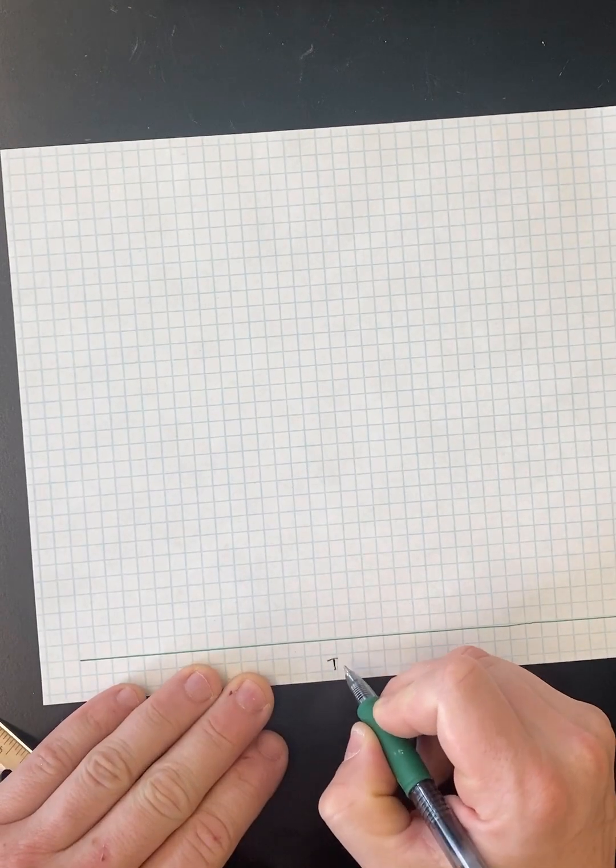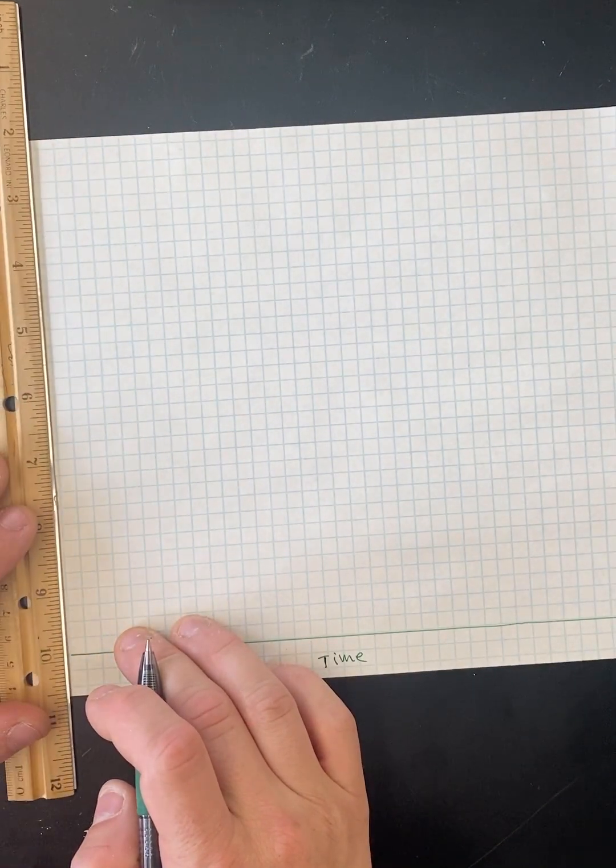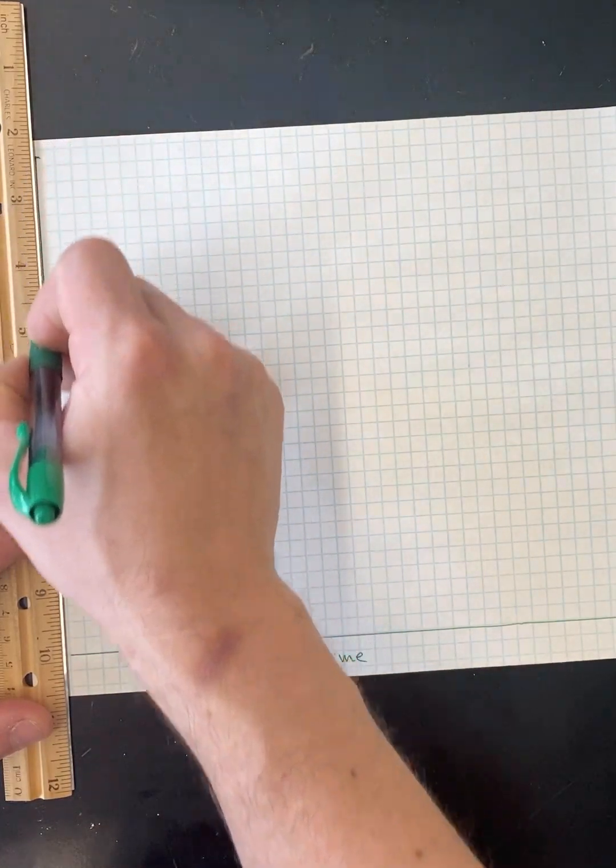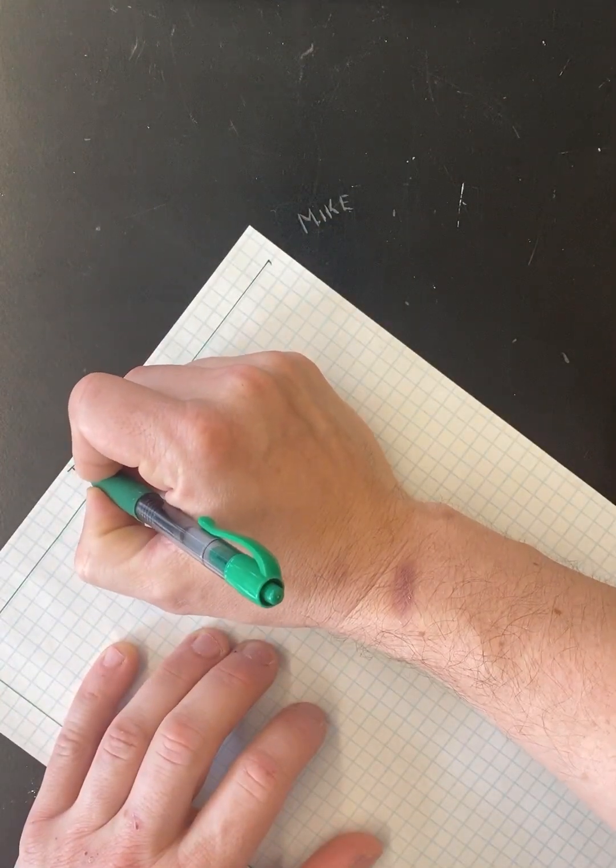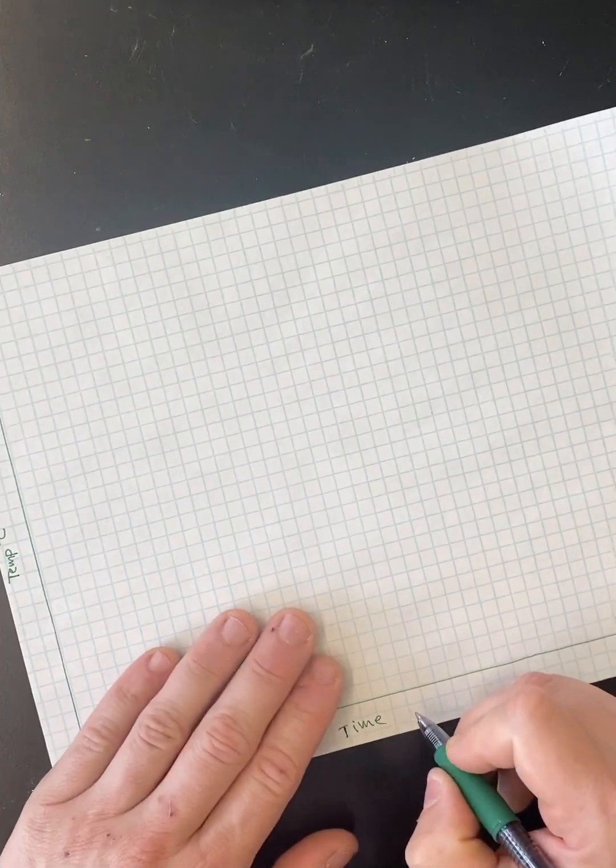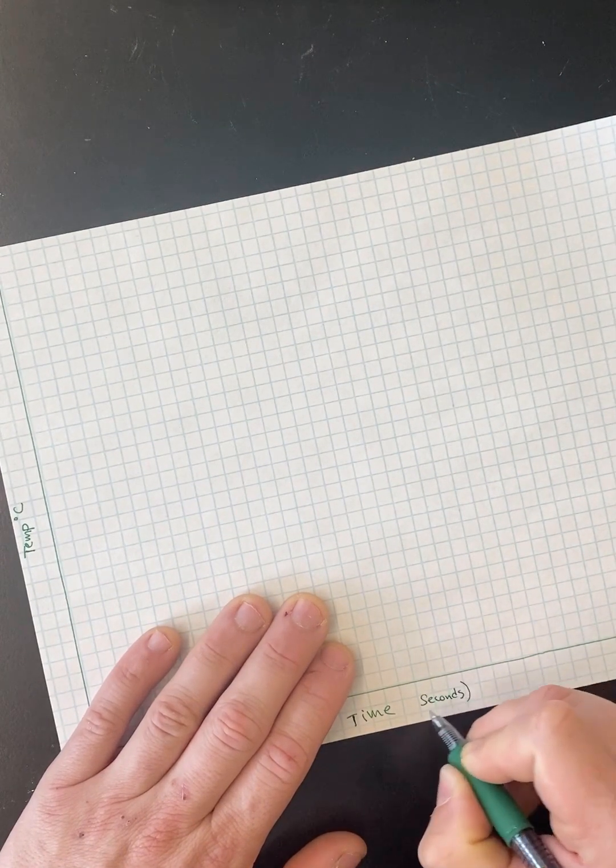This is going to be time on our x-axis and temperature on our y-axis. The temperature is going to be in degrees Celsius. Your time is going to be in seconds.